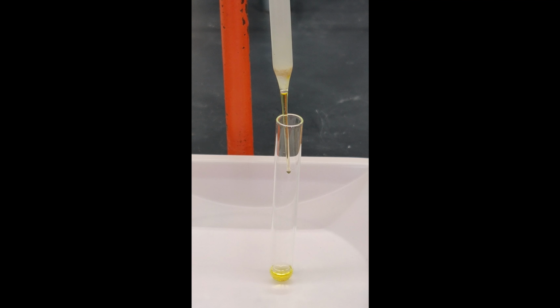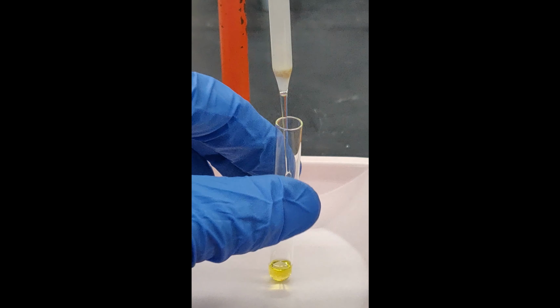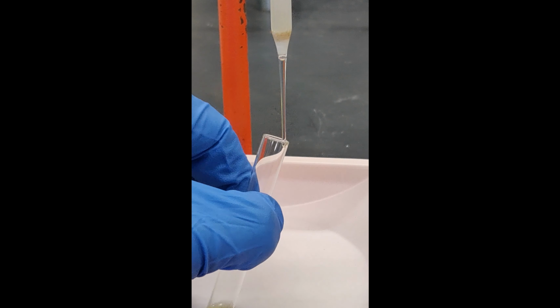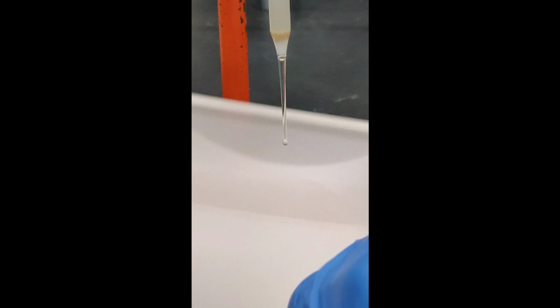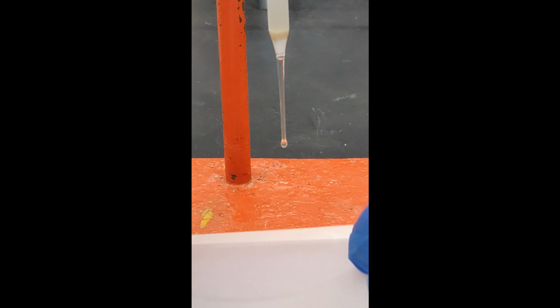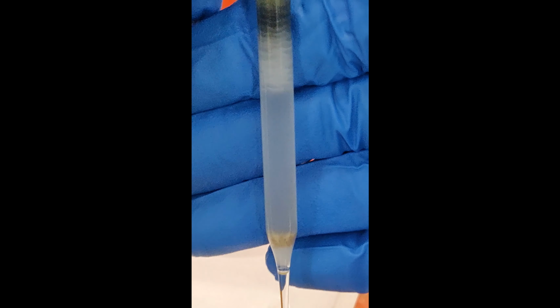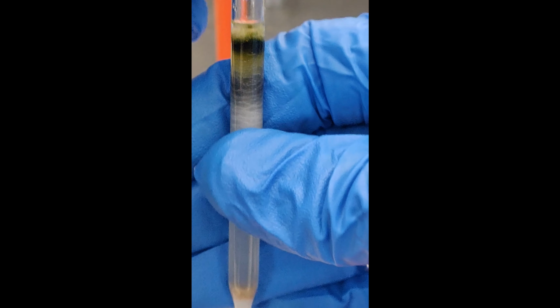Continue to apply pressure with the rubber bulb until all of the yellow pigment has eluted from the column. You can see that no more of the yellow pigment remains on the column.